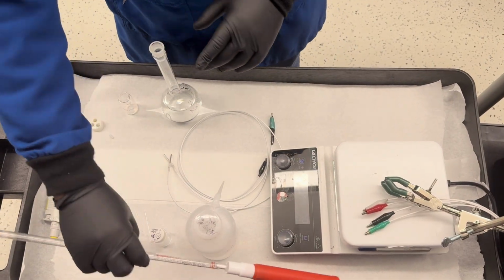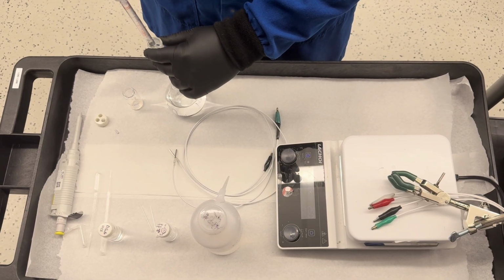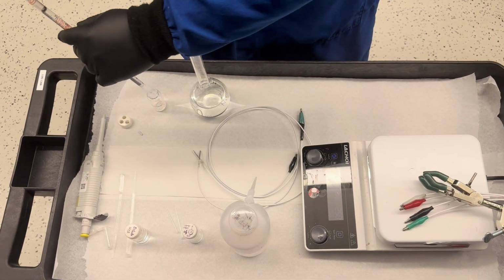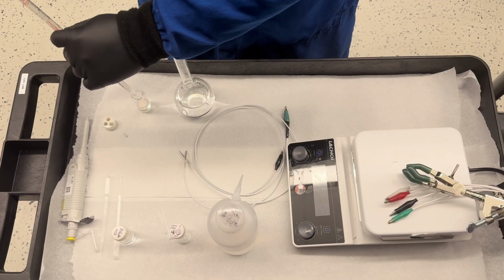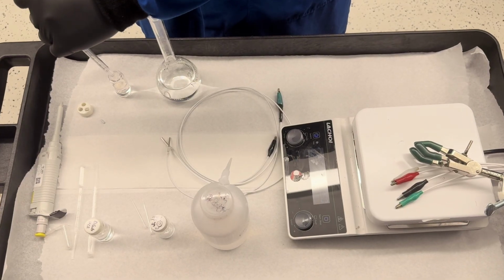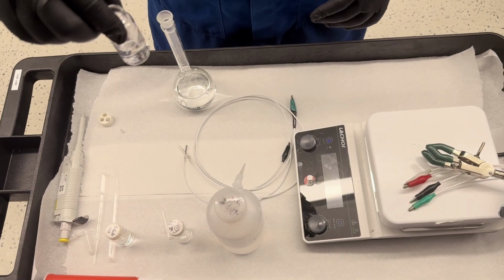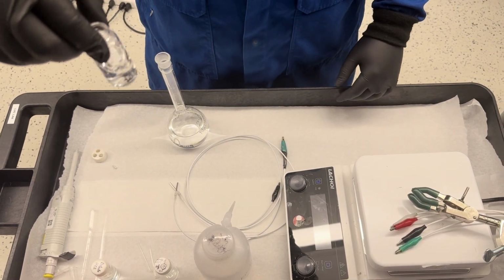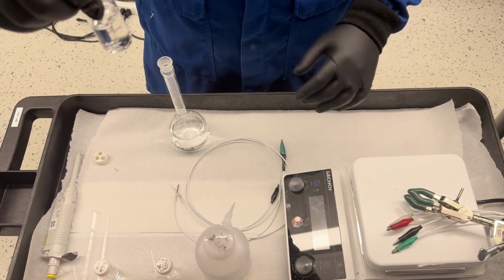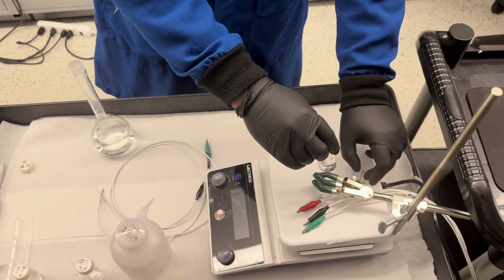We measured 13 ml of the 2% sodium hydroxide solution and added it. After that, we just shake it to make it dissolve. As you can see, it is dissolving very easily because it is a basic solution. And if something is not dissolved, we can put in a stirrer bar and stir it so that it dissolves.